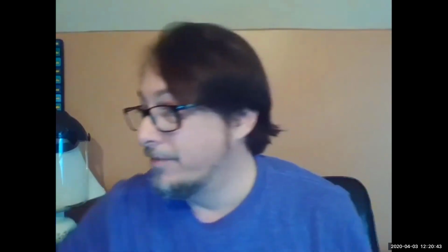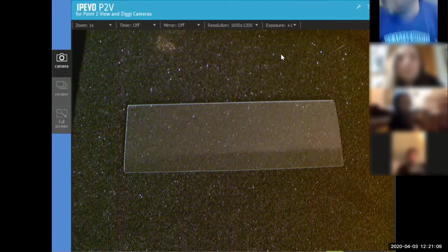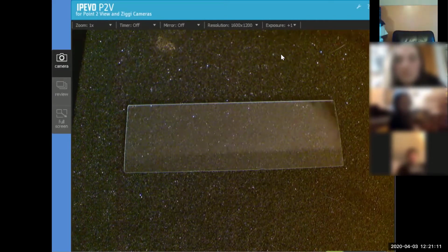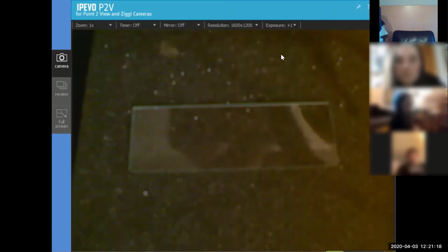What I'm going to do is take a microscope slide and put a drop of water on it, and then we're going to do something else to it. Let me switch over to my Elmo. Everybody sees the slide there? Okay, so I'm going to put one drop of water.